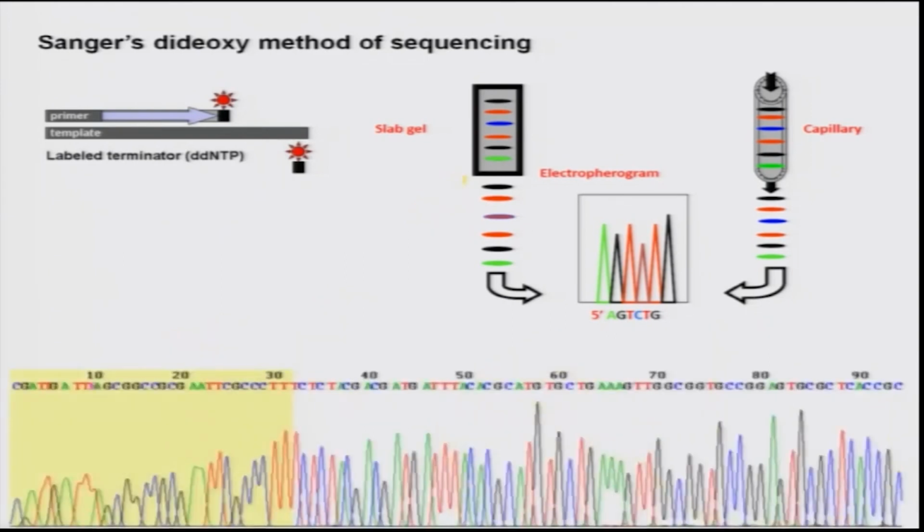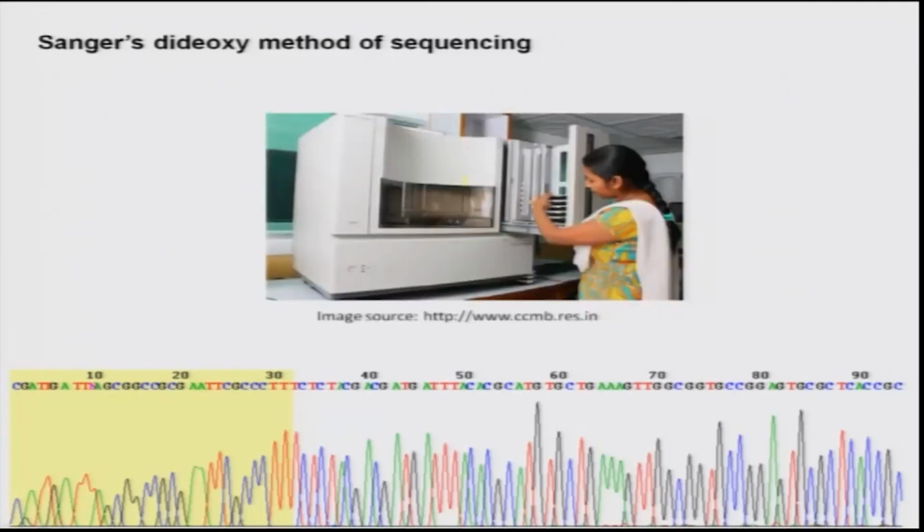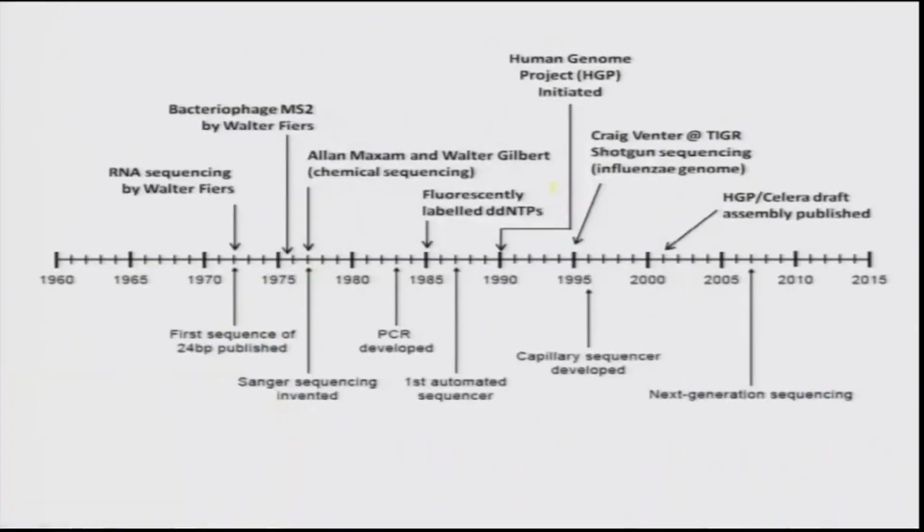So, that has changed, and in fact that has led to faster ways of sequencing the human genome. So, the capillary sequencers really helped in hastening the speed at which the sequence of the human genome was done. This is one such example. So, that is a DNA capillary electrophoresis, where you have all the samples that have been kept here, and then you have capillaries running here for the sequencing to be done.